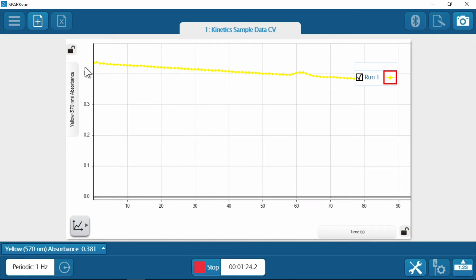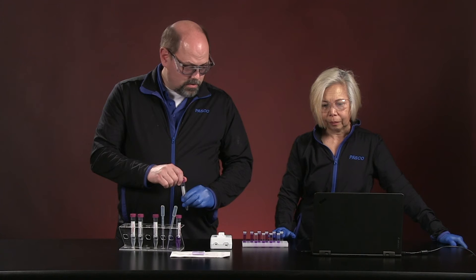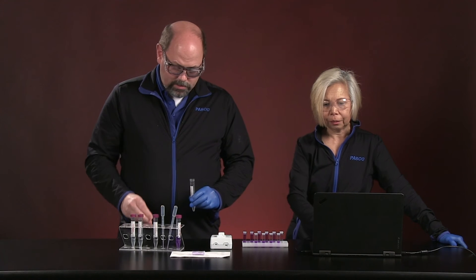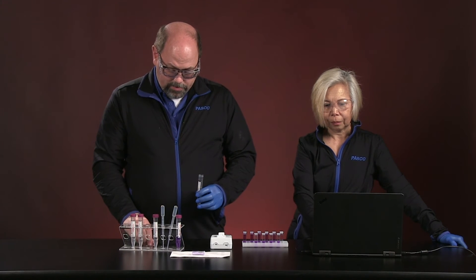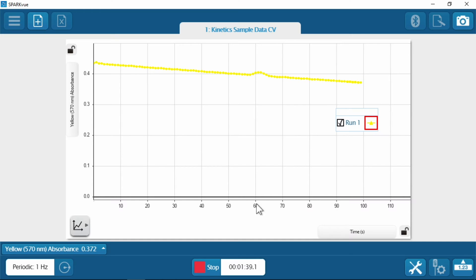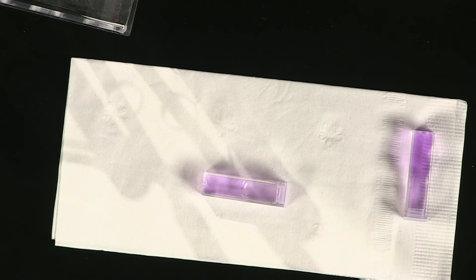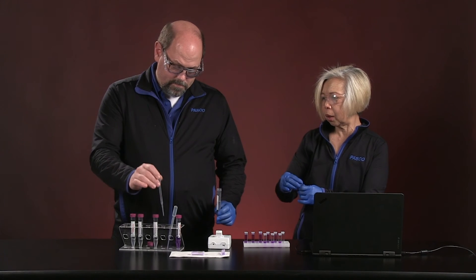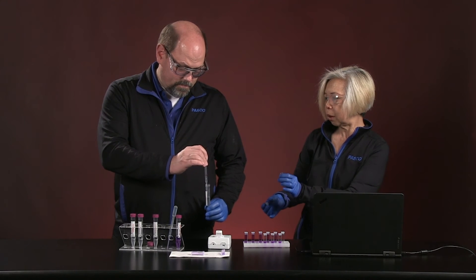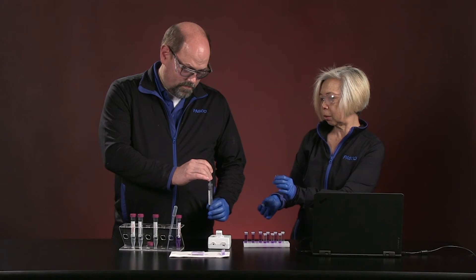While that runs those last few seconds, I'll get the sodium hydroxide ready for the next run. Here's going to be more concentrated. We're going to stop right there. Let's pull that puppy out. We can actually leave it laying down here. Let's see what happens to it over time. All right.